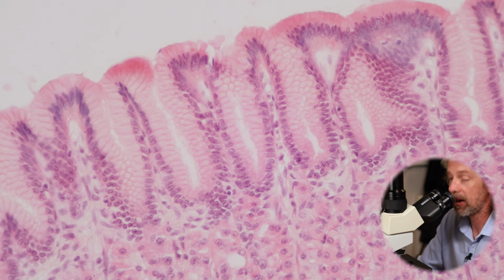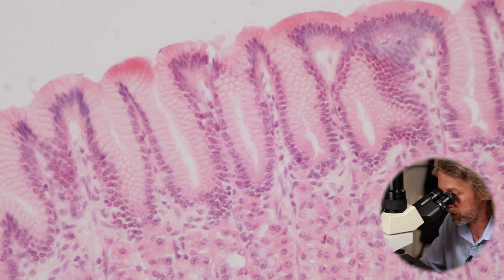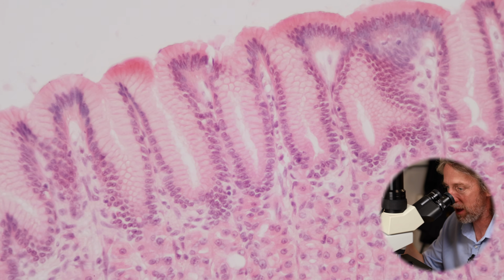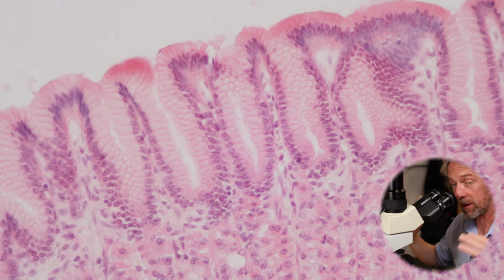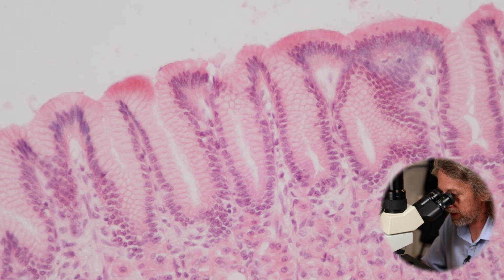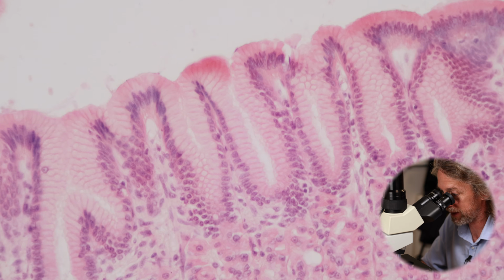Why are they making a lot of mucus? Because of stomach acid. The lining of the stomach, the epithelium of the stomach, the mucosa, whatever you want to call it, needs to be protected from the acid that the cells in here are going to produce. And they do that by producing a mucus, and it's a slightly alkaline mucus that covers the surface. It's a pretty good arrangement. So we have a lot of surface mucus cells, and we can see the epithelium folding down into those gastric pits, folding into those dips.